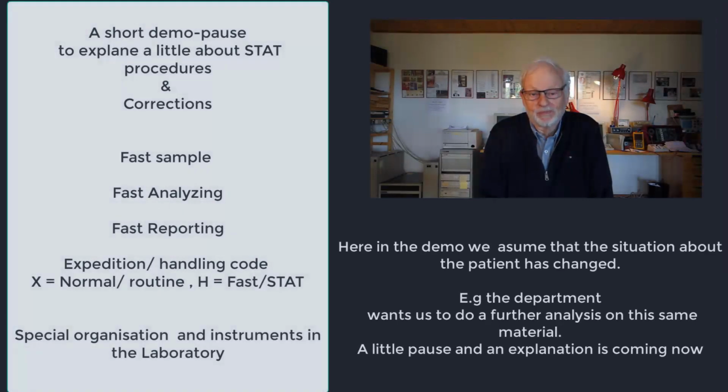A little pause. Then we will continue with a short demo about corrections in the system. Corrections require flexibility. I will assume that the situation around the patient has changed so that the department wants us to perform another test on the sample material we have here.